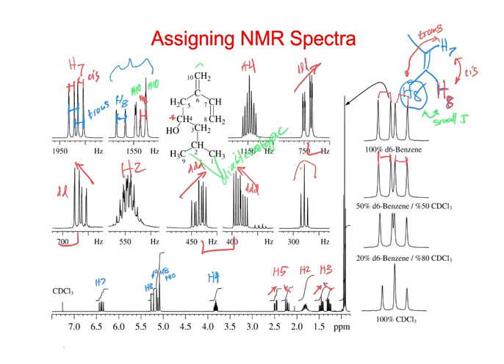They just happen to be like this in deuterated chloroform. It could just as well be that we change the solvent and they move the other way, or this way. I don't think you can really predict how the spectrum is going to change when you vary the solvent. You just have to try. This is kind of a trick: if you have a spectrum with a lot of overlapping peaks that's hard to interpret, sometimes you can just vary the solvent and you might luck out and they move apart. And then you can analyze it more easily.